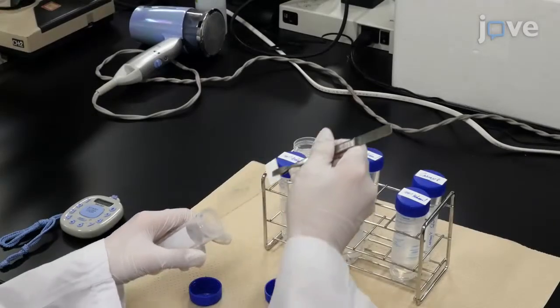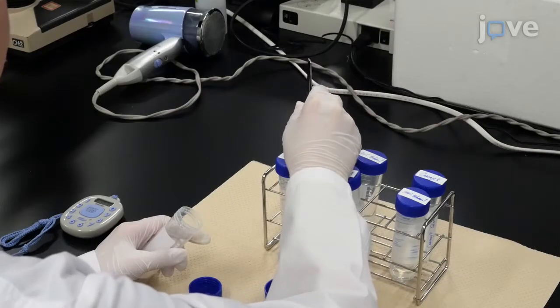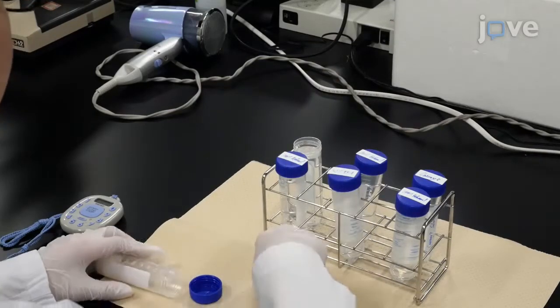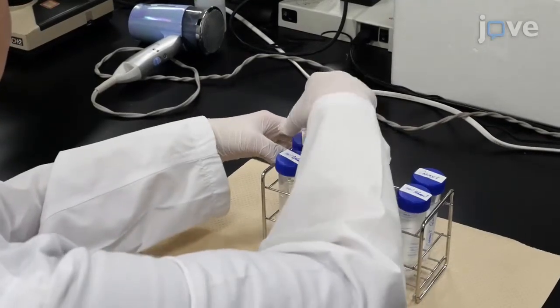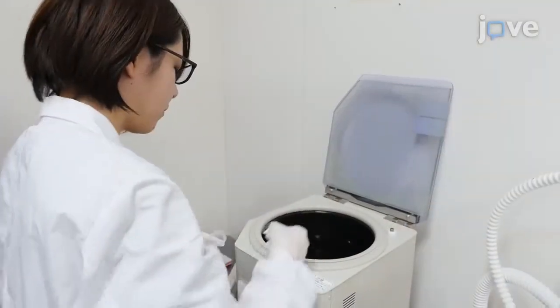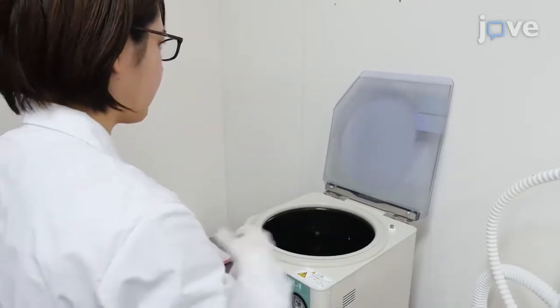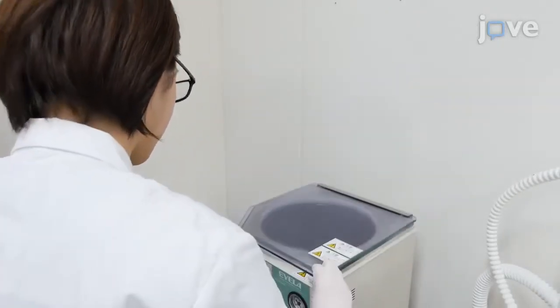To rinse the tissue sections, immerse the samples in 40 to 100 milliliters of 70% ethanol in a glass staining jar for 30 seconds. To remove endogenous lipids and inorganic salts, wash the samples using the washing sequence listed in the text protocol. Then dry the samples in a vacuum for 30 minutes.